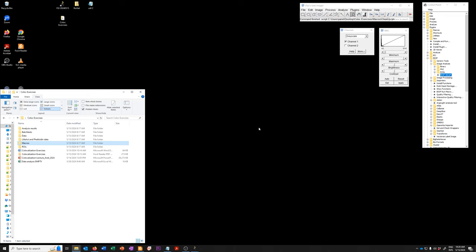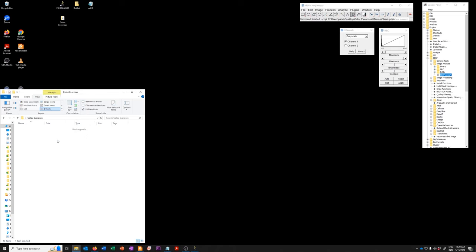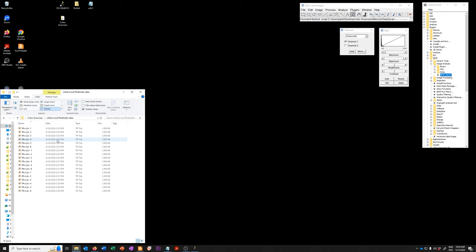For that we're going to use this LIFACT and phalloidin data. LIFACT and phalloidin are markers for filamentous actin and you'll see in this folder there are 18 items and they consist of six images each of different conditions.